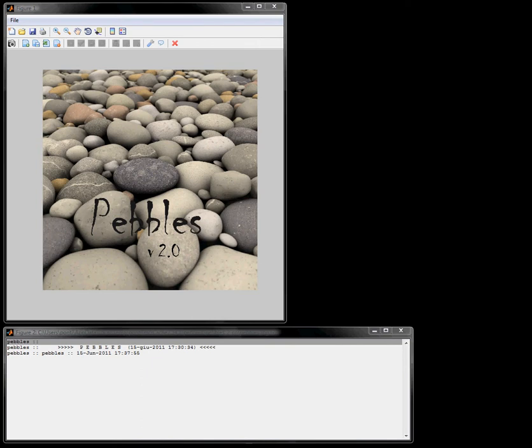Hello. In this tutorial I'll show you the basic operation of Pebbles. Pebbles is a software for the recognition and measurement of nanoparticles from transmission electron micrographs. When you first start Pebbles you will find two windows: the main window where the command buttons are collected and where the TEM images will be shown, and a log window where all operations and results from Pebbles will be logged. I assume that you are familiar with the theoretical background of Pebbles, so let's start by loading an image.